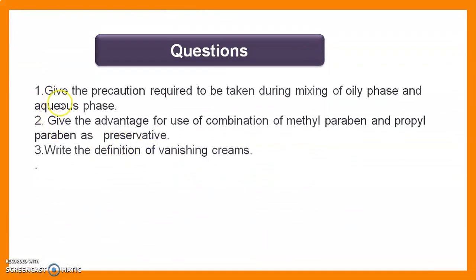This is the first question. Give the precaution required to be taken during the mixing of oily phase and aqueous phase. While mixing the oily phase into the aqueous phase, we require continuous stirring and maintenance of the temperature. Proper temperature should be maintained. Here we maintain a 60 degree Celsius temperature for proper mixing.